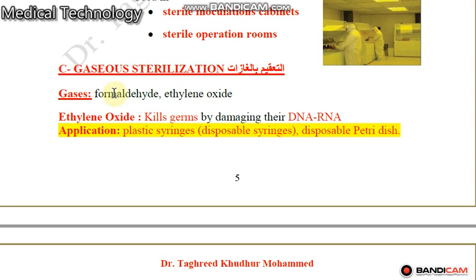Formaldehyde is very important to sterilize the ground, walls, lights, non-living materials in your laboratory, in the operation room, non-living things.